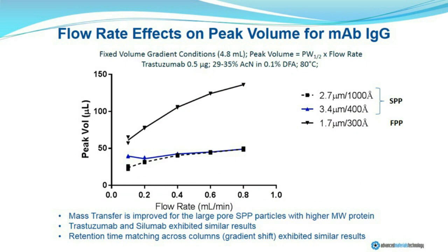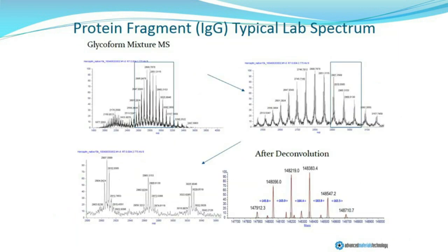in order to now focus on why the provision of alternate mobile phases is particularly important when you begin to look at, for example, therapeutic monoclonal antibodies.